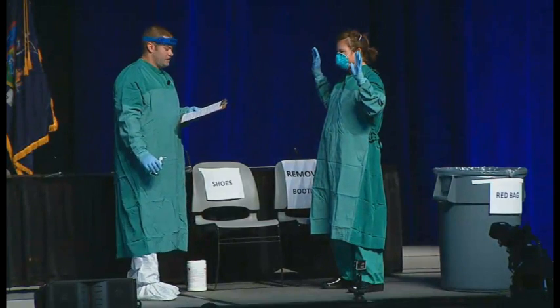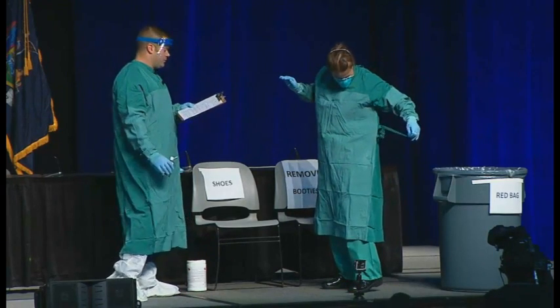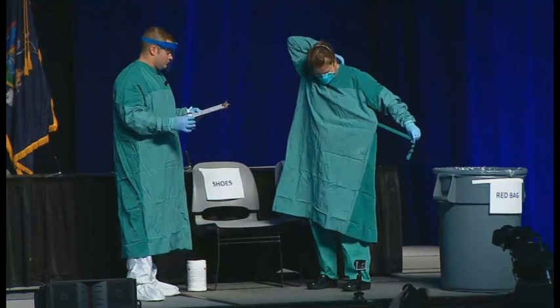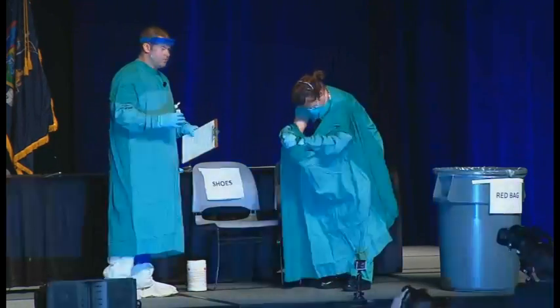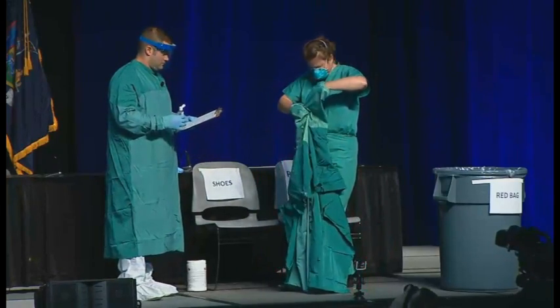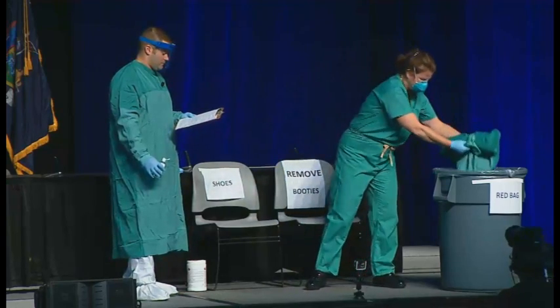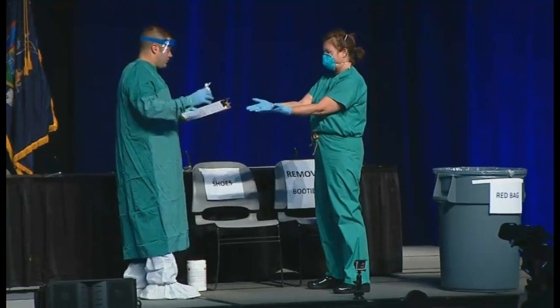Now Barbara is going to slowly and carefully remove the gown — pull the gown away from the body, rolling it inside out, only touching the inside of the gown. The trained observer, since I'm in PPE, can assist if necessary. A good trick Barbara is going to show is to step on the inside of the gown to help remove it, because her shoes are clean and the inside of the gown is clean. She's taking care to make sure it's the inner surface she's touching. Again, we're going to perform hand hygiene.